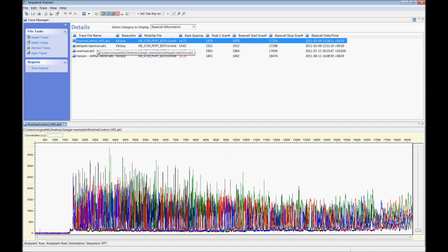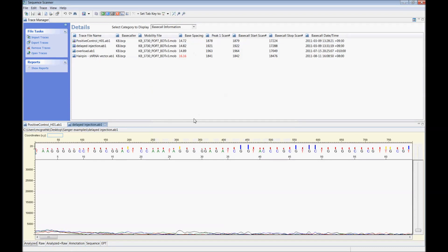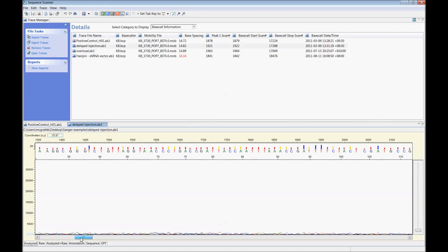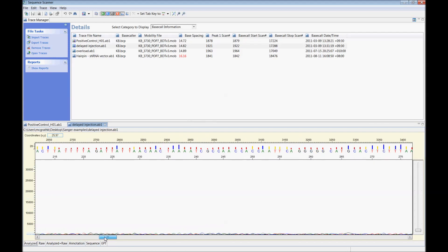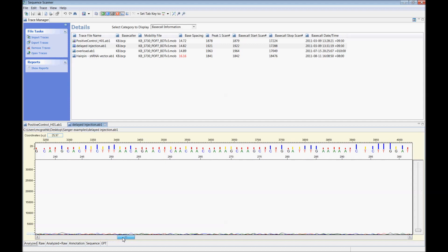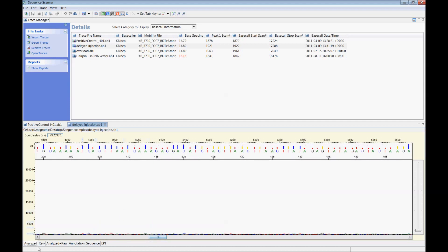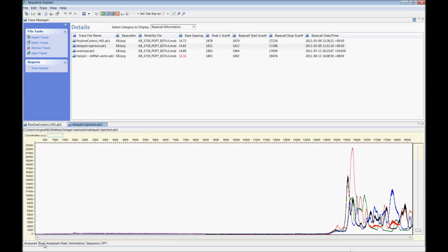This next example is a sequence that shows a delayed injection. Now viewing the electropherogram may look like a failed read with no signal visible. But viewing the raw reads shows some peaks appearing at the very end of the run where they appear wide and wavy.